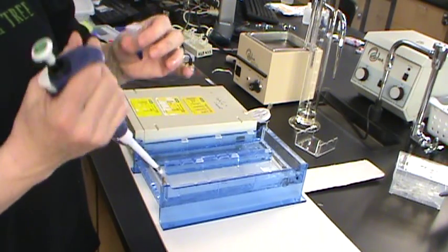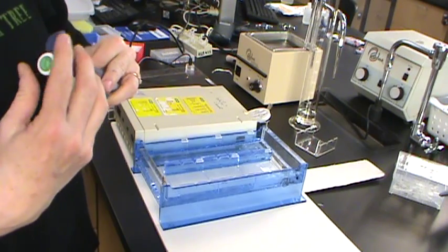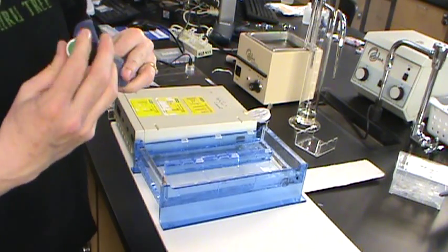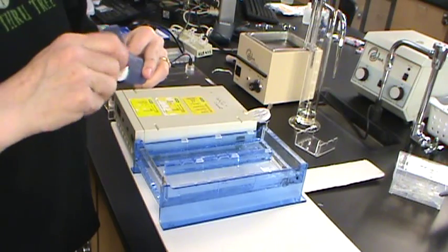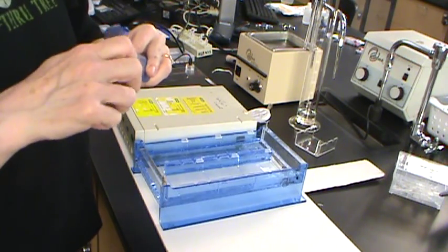And now we're ready to apply these to our wells. The volume that is suggested is 40 microliters. And so you'll want to set your plunger for 40 microliters, so it says 40.